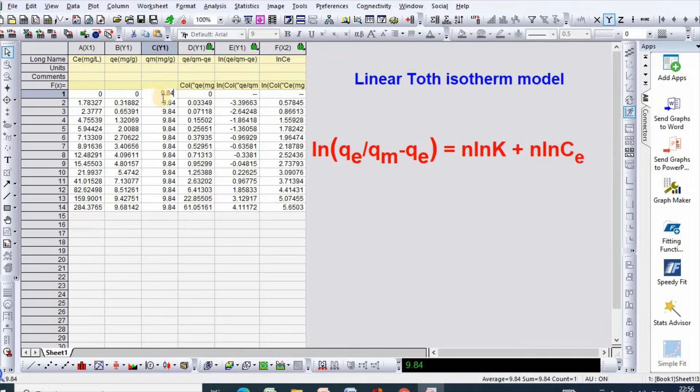9.82 or previously it came 9.84. So, I have written here 9.84. Then, you need to convert QE divided by QM minus QE.